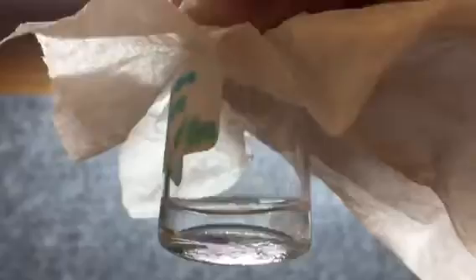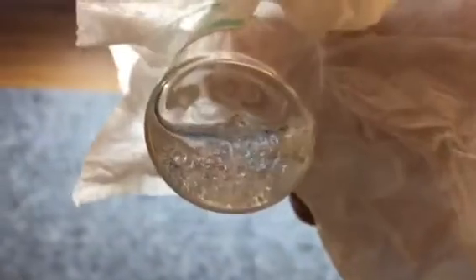You can see very clearly there are a lot of crystals in the bottom of the saturated solution. Yeah, there's a lot of crystals. Some are larger, some are smaller. You can see that clearly.